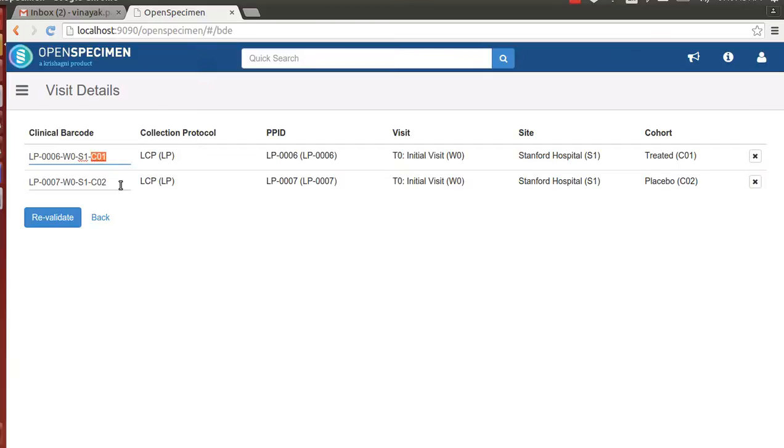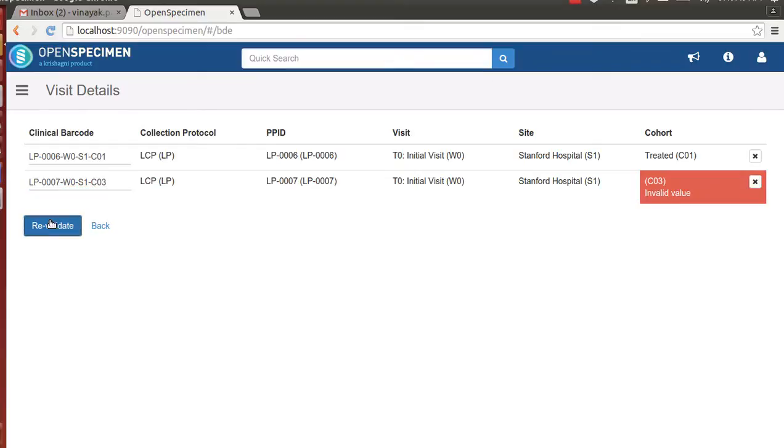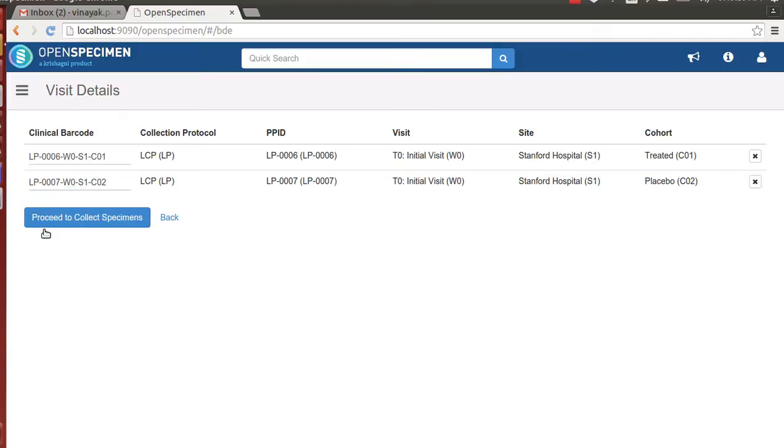If the user inputs something invalid, OpenSpecimen highlights the invalid value as shown on the screen. Let's rectify this error and move further. Once the technician reviews and confirms the details entered are correct, we proceed to collect primary specimens.